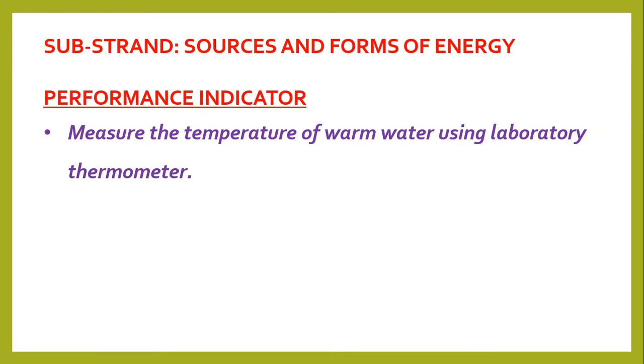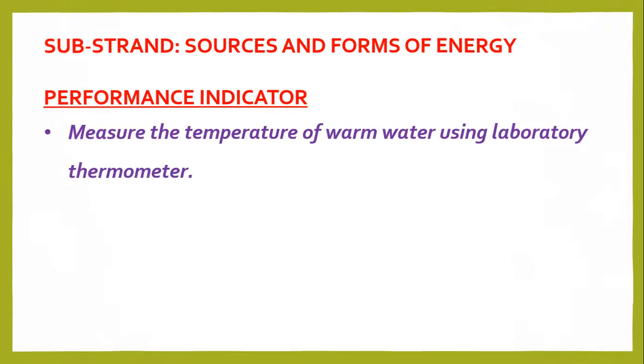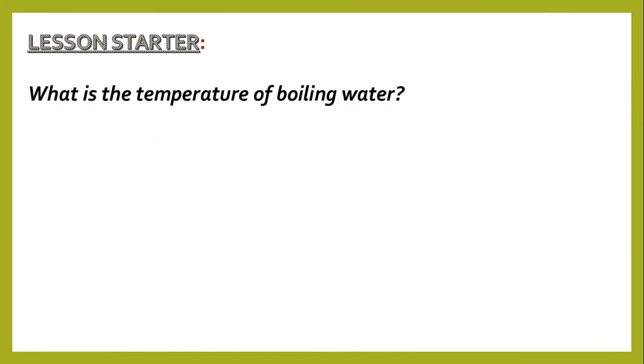In our previous lesson, we touched on how to measure the temperature of a person using clinical thermometer. My question is, what is the temperature of boiling water?